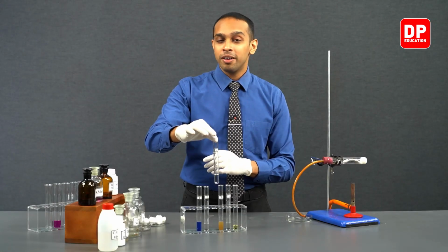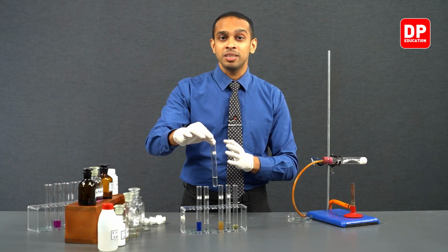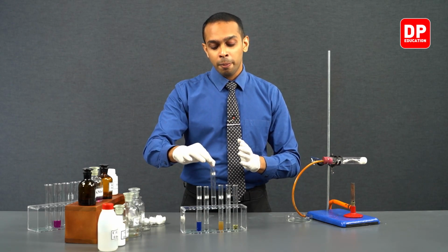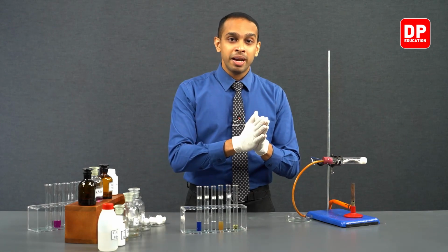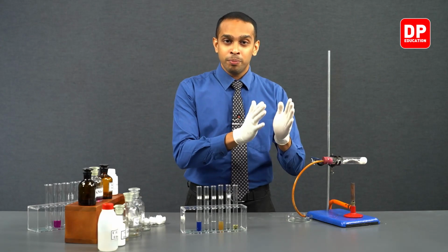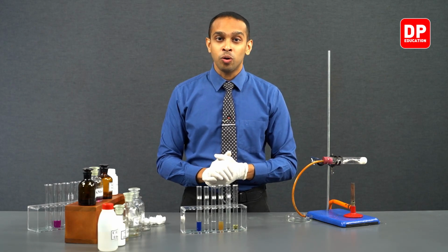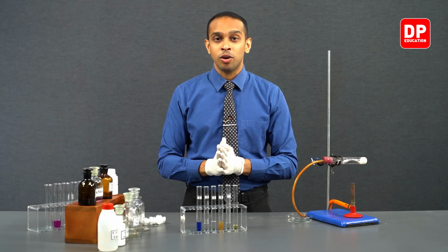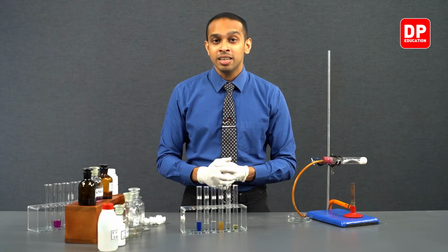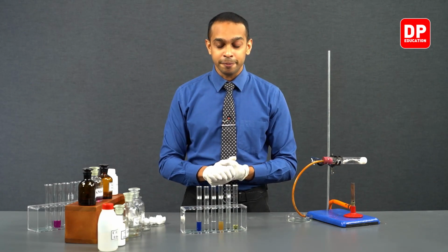So what you have here is Mn2+ ion solution that was formed due to reduction of permanganate ions into Mn2+. Now students, in acidic medium, permanganate ions get reduced all the way to Mn2+. In alkaline medium, permanganate ions can only get reduced up to MnO2, or the +4 oxidation state of manganese, forming manganese dioxide, which is a brown color precipitate. So we saw that in test tube B.